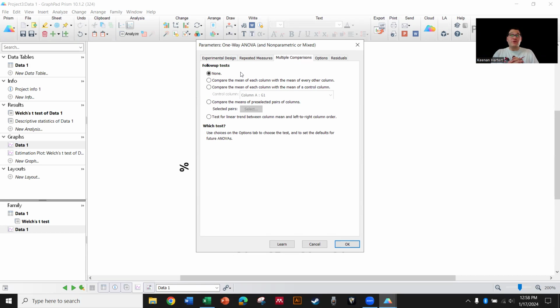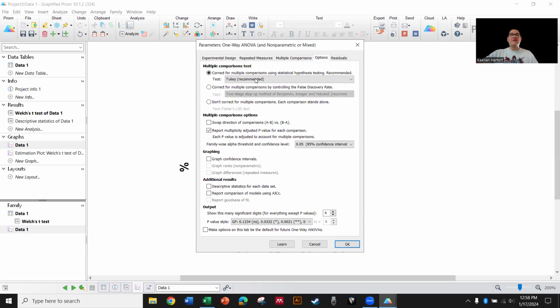All right, so multiple comparisons. What an ANOVA p-value will give you is just that one of these groups is different. Somebody's different. To get really good comparisons between each group, compare the column to every other column. We're going to do multiple tests. You can do Tukey, Holm-Sidak is fine too. These are all multiple comparison tests. So remember, if I had done 100 t-tests, 5 of them would have randomly been significant, right? Because of the 0.05 p-value. Multiple comparisons is going to stop that for us.